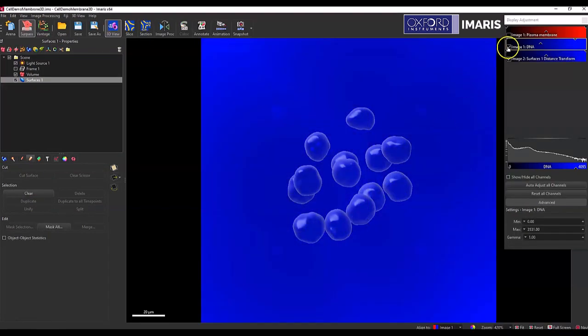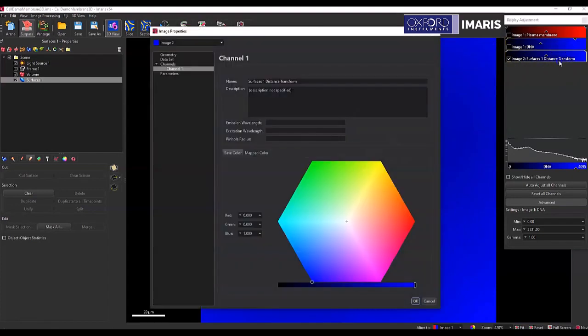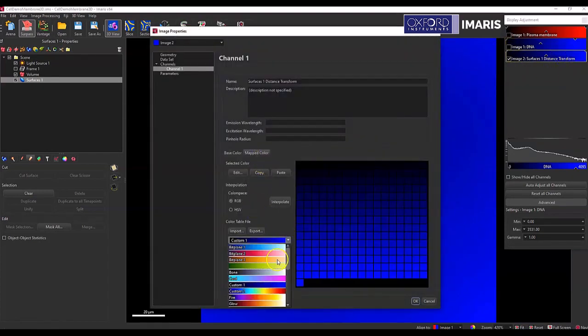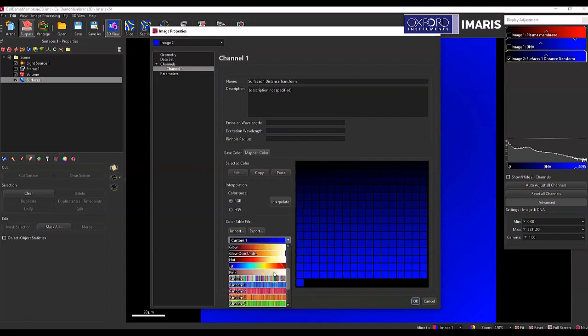And now you can see over here, I have a new channel that's created. I'm just going to color it differently so it's a little bit easier to see what I'm working with.